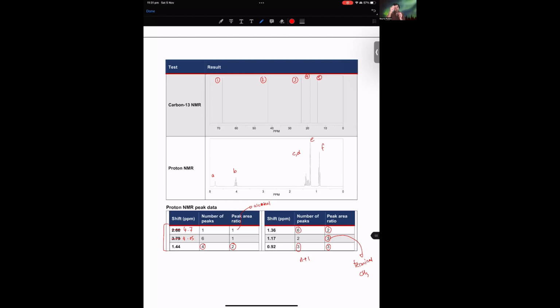And if there's only 1 proton there, that to me suggests that that is the carbon that has the OH coming off of it. So I know I'm doing a lot of hand gesturing here and talking it through, but that's the kind of thought process that I'm going through to get there. So far I have CH3, CH2, CH2, CH, which I think has the OH off of it, and then the CH3 that I originally talked about at 1.17. This lines up with there being 5 peaks in the carbon NMR. And what we really need to do now is confirm, are there actually 5 carbons?